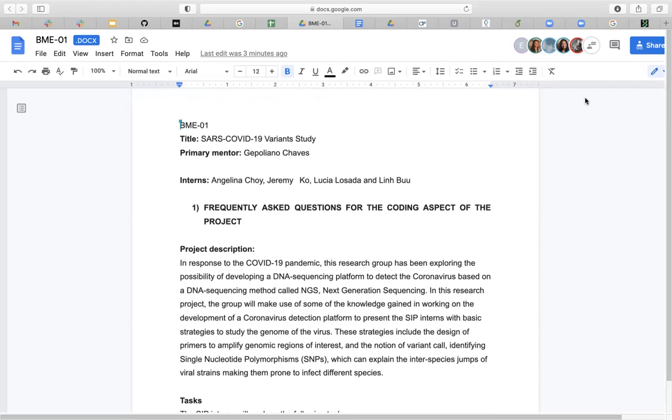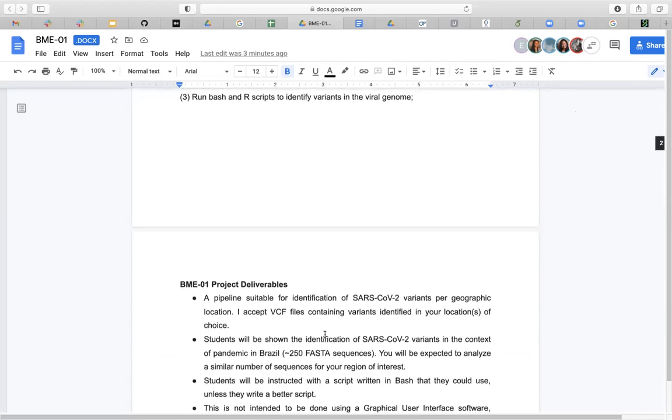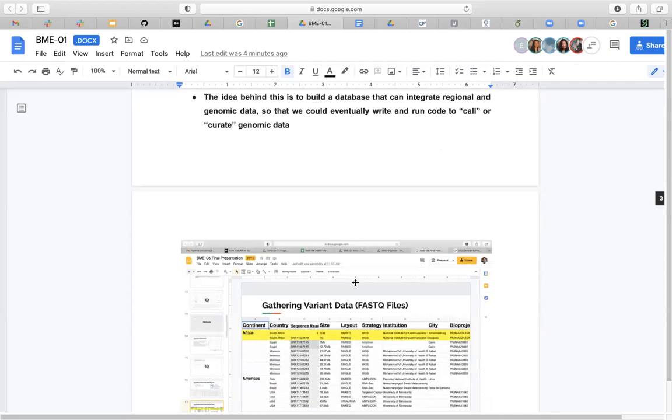Yes, it's clear. I should have written it here somewhere, or it should be somewhere for you, that from the VCF files, we can basically grab any mutation that we want. And to tell you up front, we are going to grab mutations using the nucleotide coordinate. And then one thing that is possible to be done with that is, let me see.